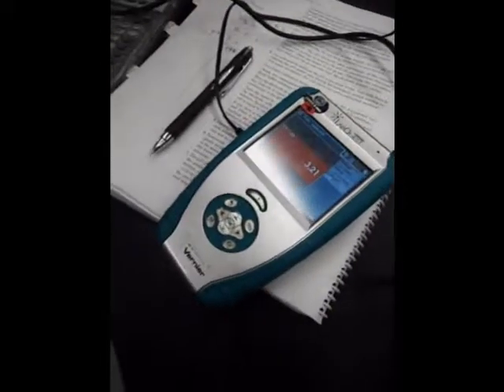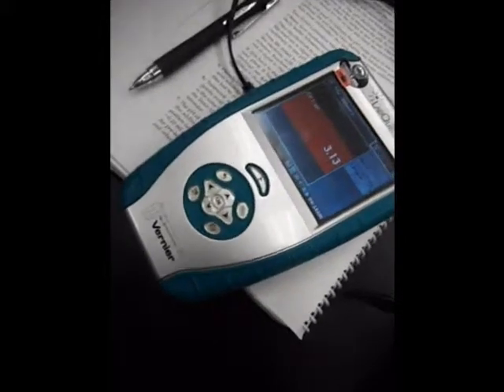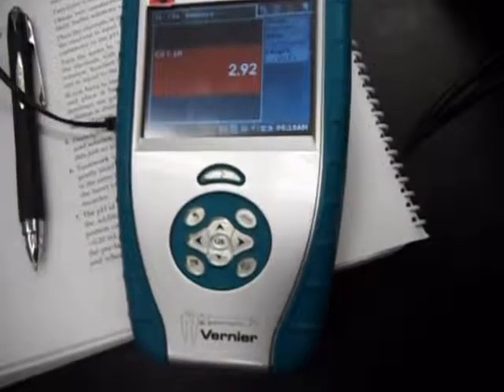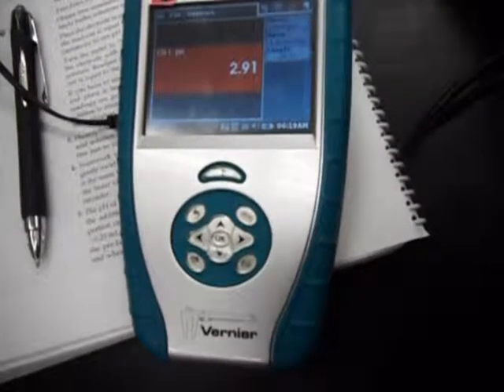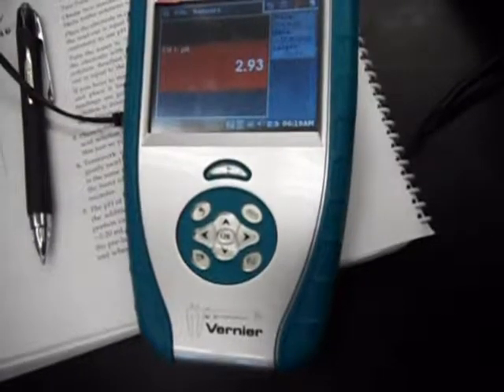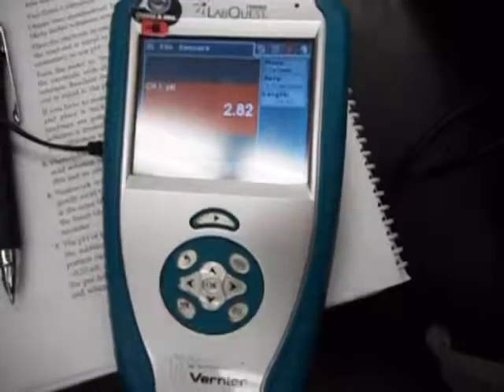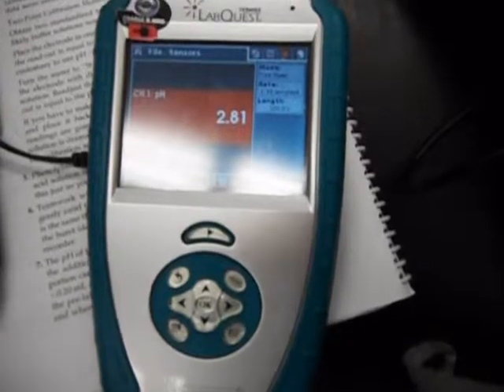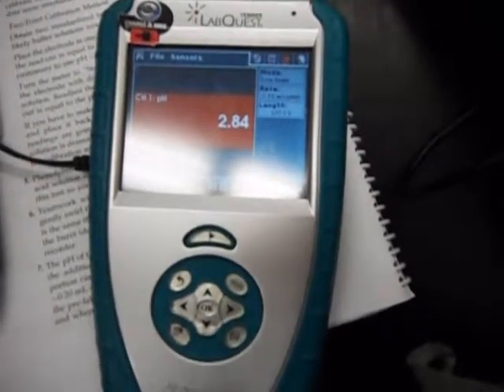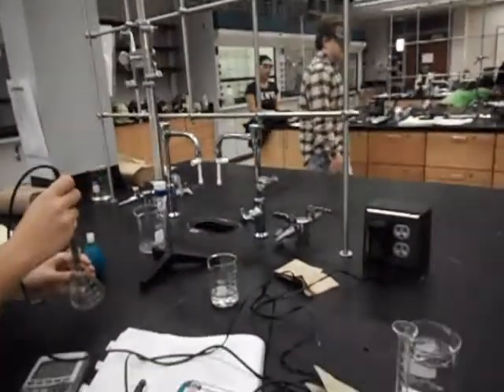This is a titration between a strong base and a weak acid. The pH should go up as the base is put into the weak acid. Once the pH stabilizes, you want to record that into your notebook.